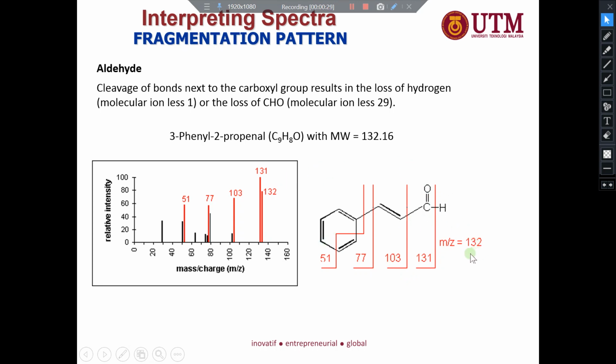Okay. And for the aldehyde, you still will have what we call the molecular ion. Molecular ion is still there. Okay. Or you can lose as well. The next one you can lose the C double bond OH, dia akan potong dekat sini. Yang ni the next preferable one for the cutting lah, if you want to cut out. Okay. So kat sini ni apa yang berlaku lah.